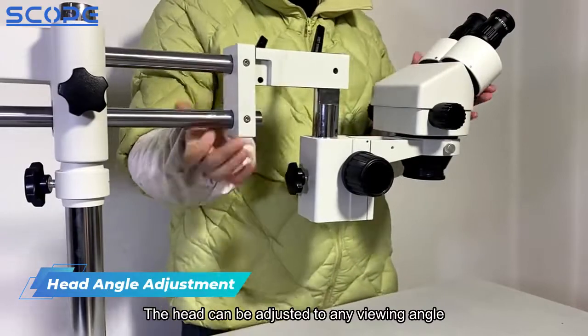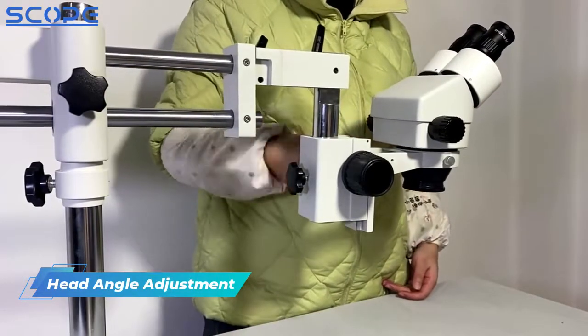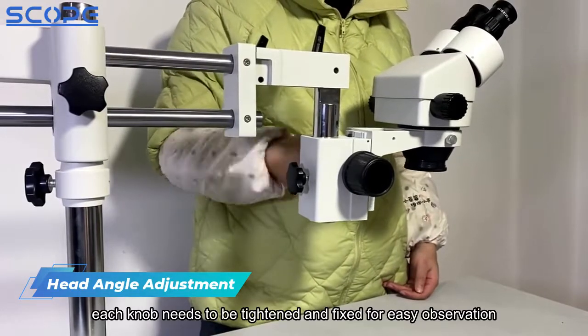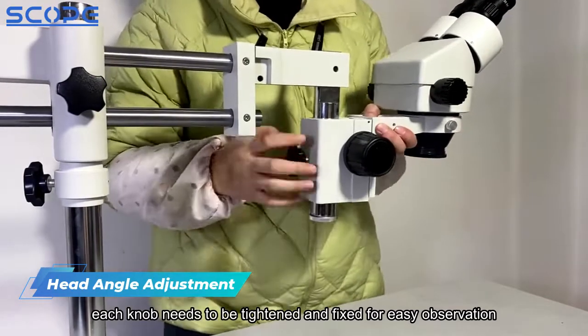The head can be adjusted to any viewing angle. After the angle is adjusted, each knob needs to be tightened and fixed for easy observation.